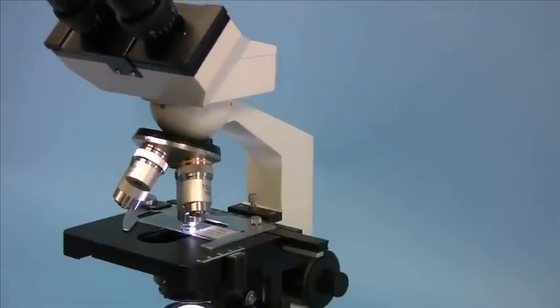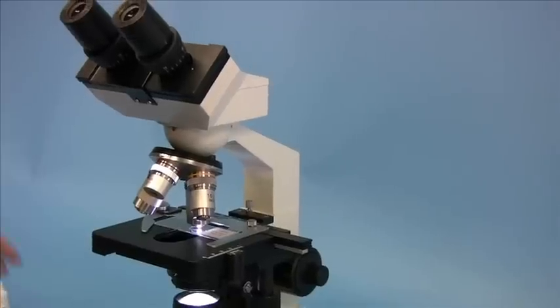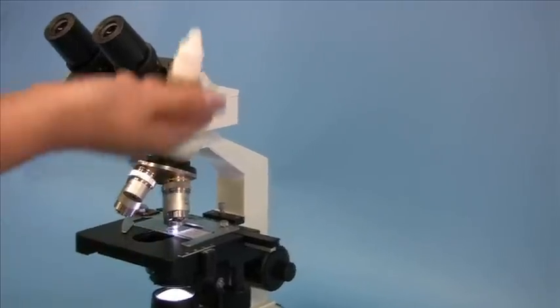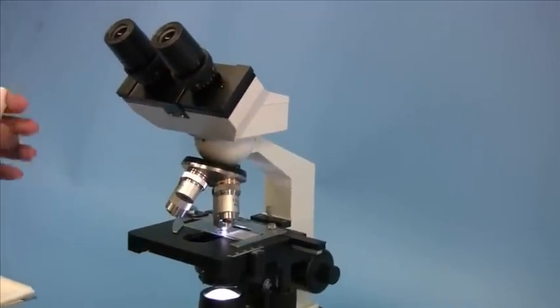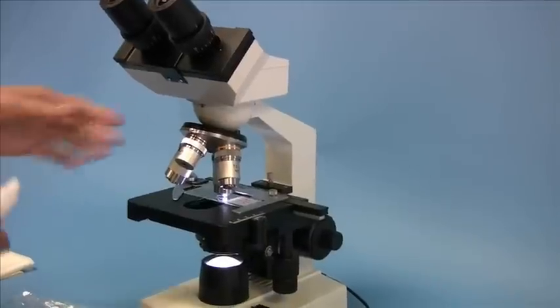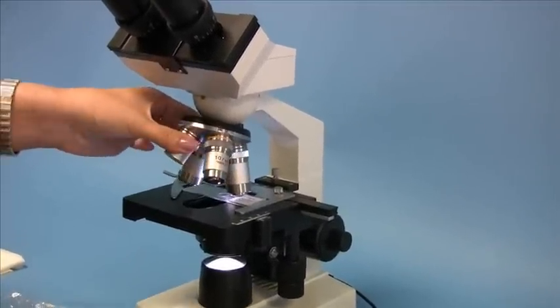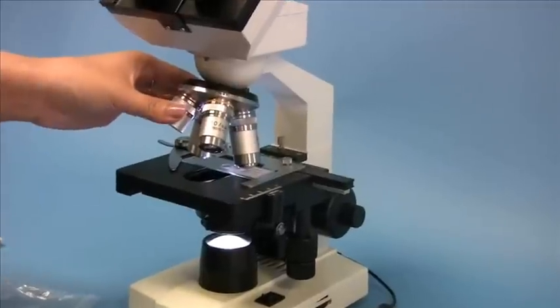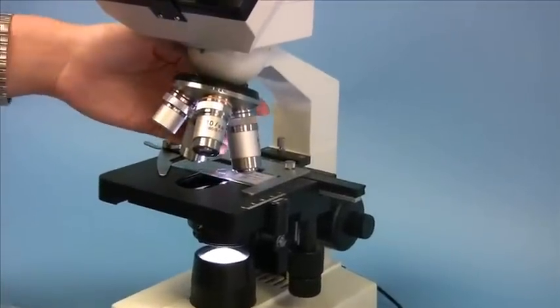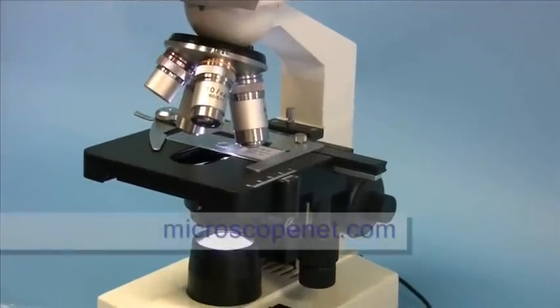For the 100x objective, the same procedure applies. However, you also need to use the immersion oil. In order to do this, simply rotate the revolving nose piece so that the observing position is right between the 40x and 100x objective.